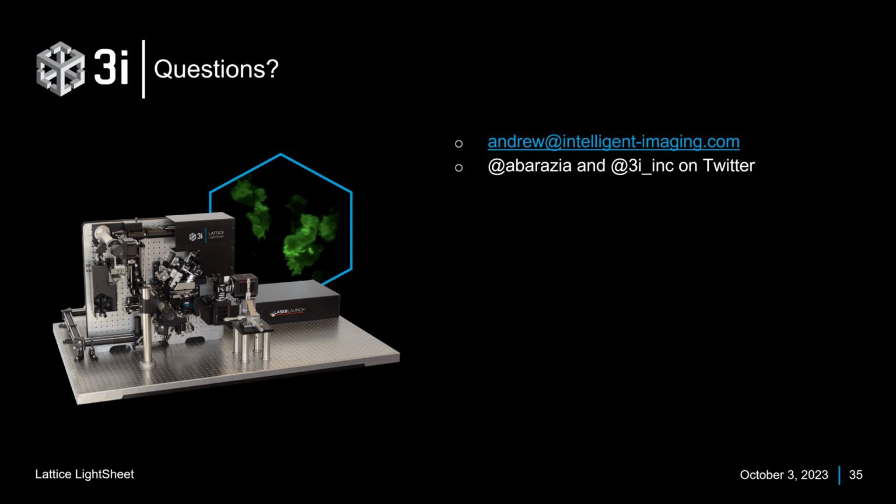So happy to talk there. There are probes here that you can use. The lysosome movie I showed is LysoBright. I've switched from LysoTracker to LysoBright. It is just better. It seems to work really well. I use a lot of MitoTracker of all the colors, LifeAct, SiR-Actin and SiR-Tubulin. Spirochrome is in Denver, so it's really nice. I can just ask them for some. And they have a lot more that they're developing as well.